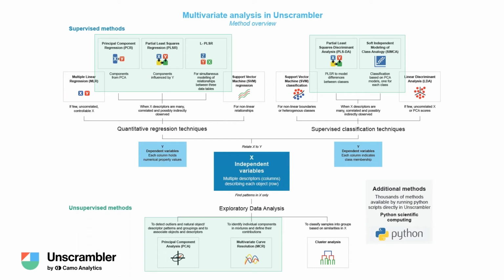Using these tools, you basically have what you need for most of the situations you might come across. But in some cases, you might find that you need to import some very special data in some very special format from some old instrument, from some data scheme in the cloud that is not standardized. That can require a little manual work.